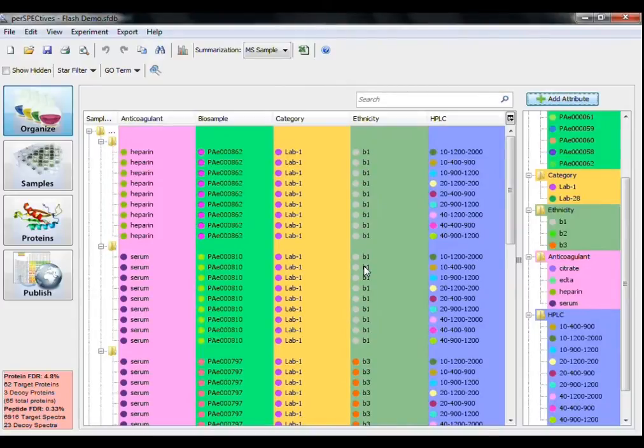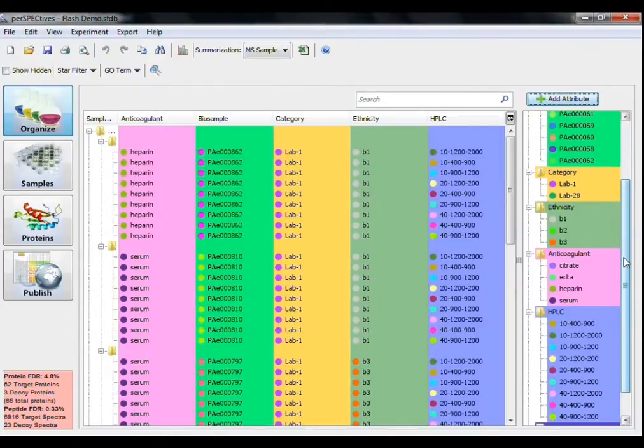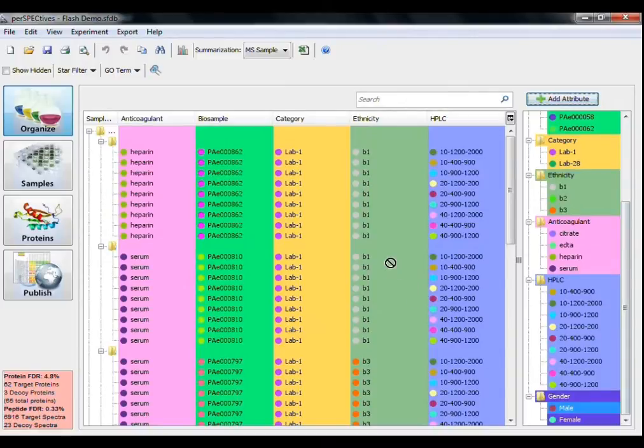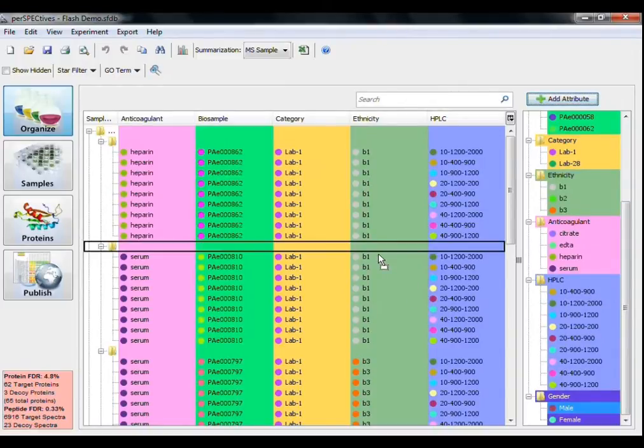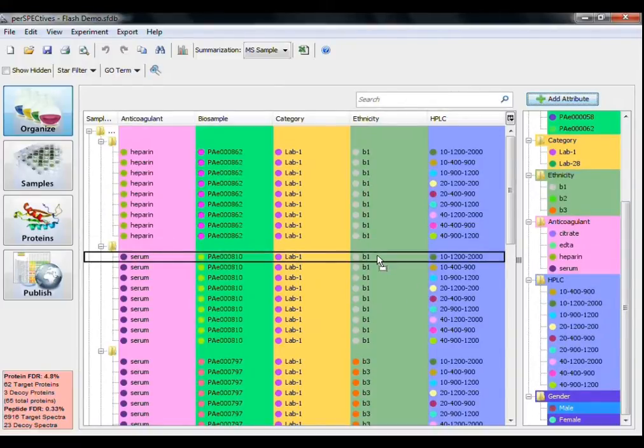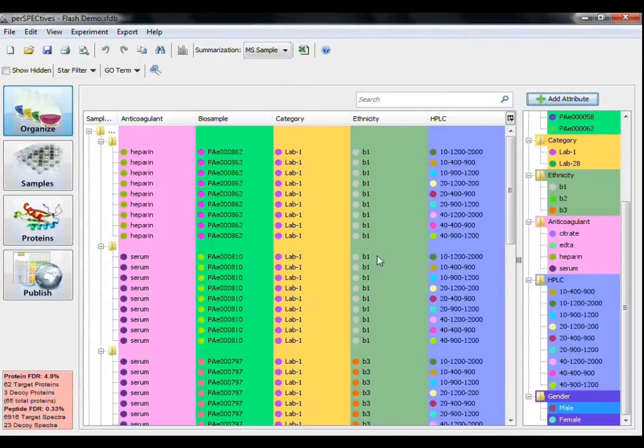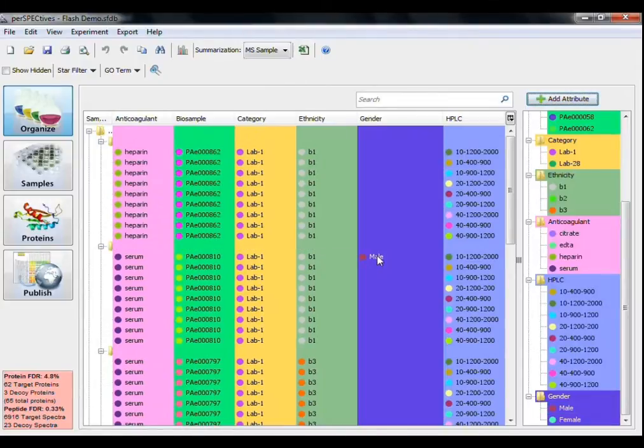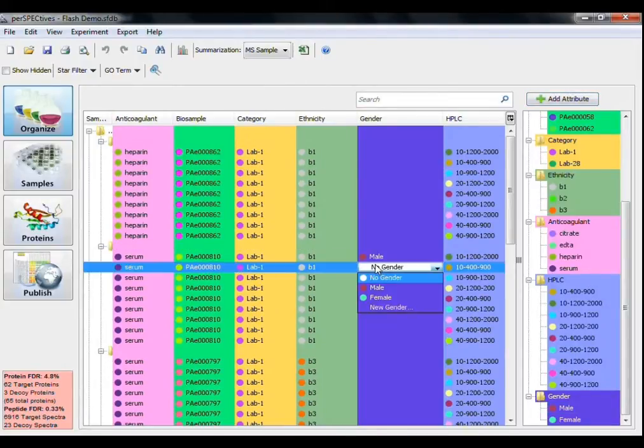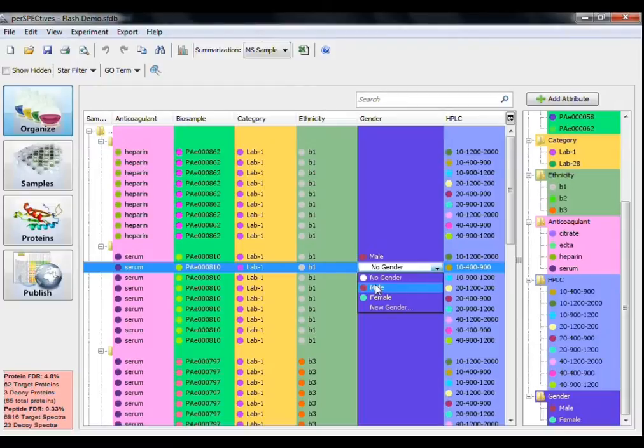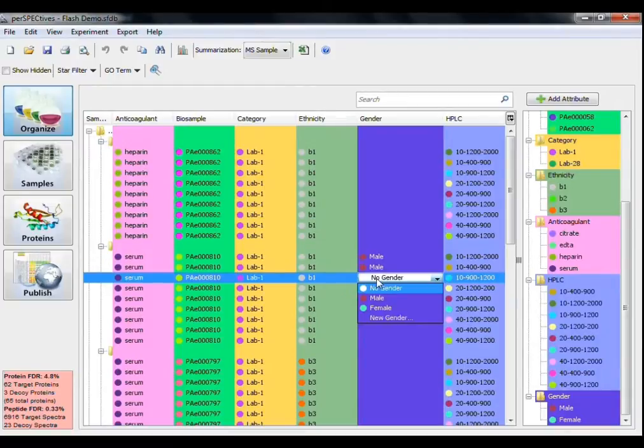To apply an attribute group to an mzsample, simply drag an attribute to one of the mzsamples, and Perspectives will add the attribute option to the table. To add attributes from the newly added group to other mzsamples, there is a drop-down menu in the New column where you can select Defined Attributes from that attribute group.